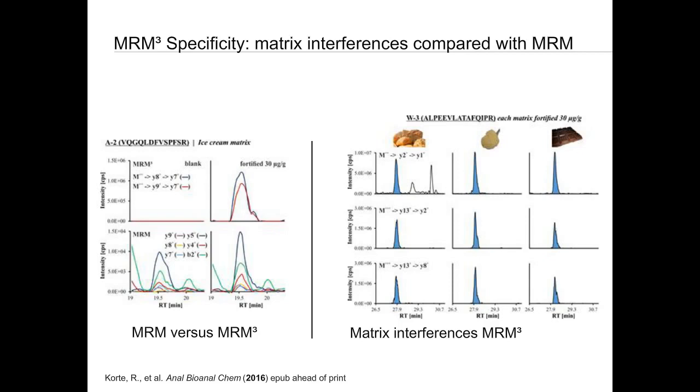On this last slide, I'd like to give you a very brief idea on the factors that might influence quantitation once it comes to absolute quantification. The aim finally is to have something like risk-based management of food allergens using threshold levels, which need to be identified, and there are studies around in Europe, the Europrevall study, for instance, where the eliciting dose for individual allergic patients is identified in a clinical setting. So we now have an idea what the eliciting doses, and thereby the amounts in food, are which we need to detect. And in principle, we are now underway to define such threshold levels.